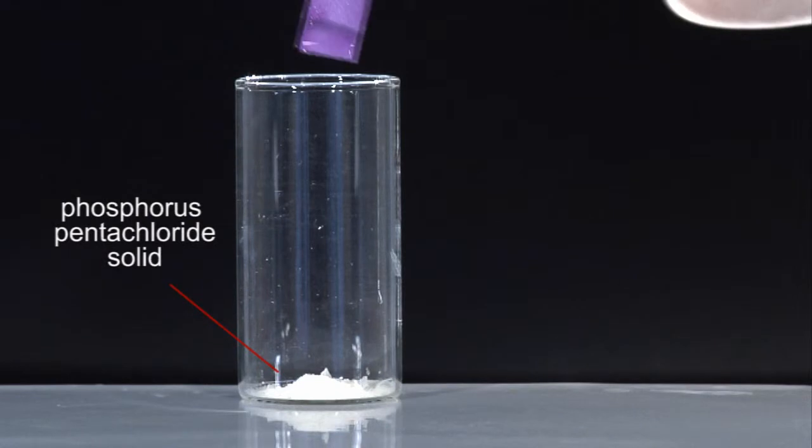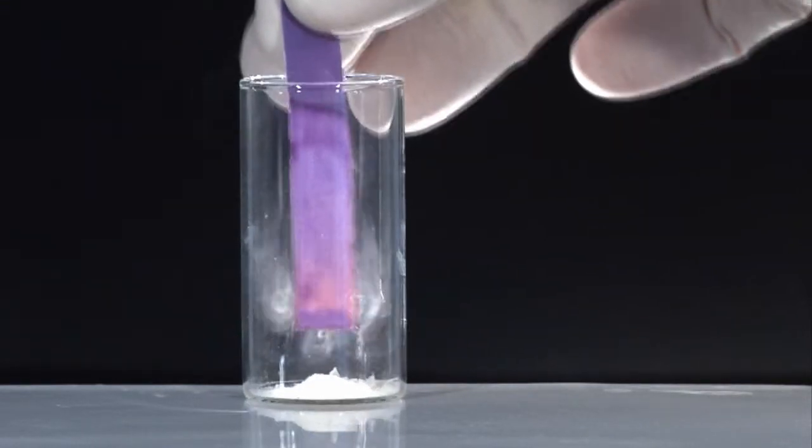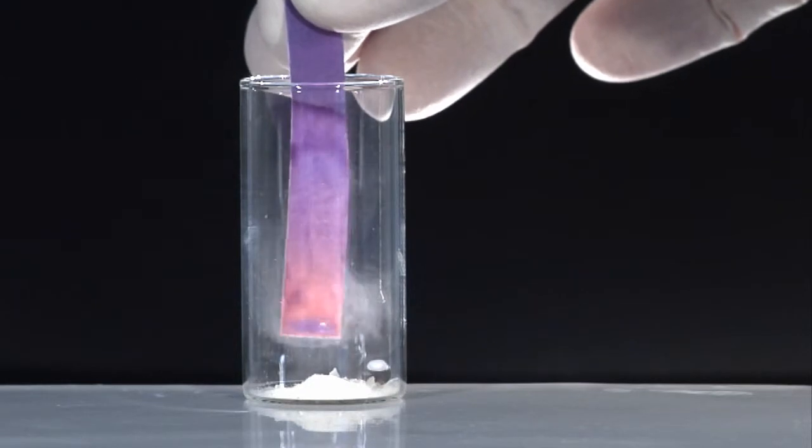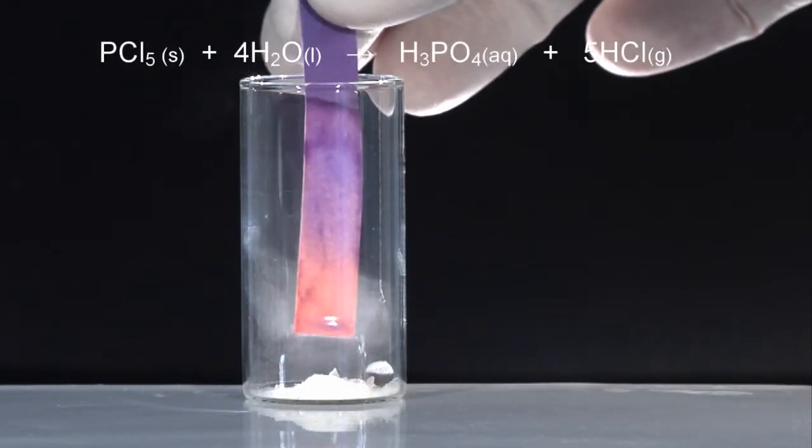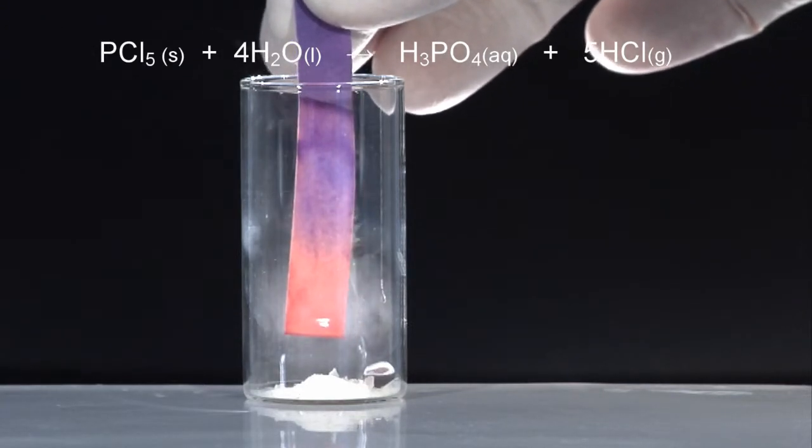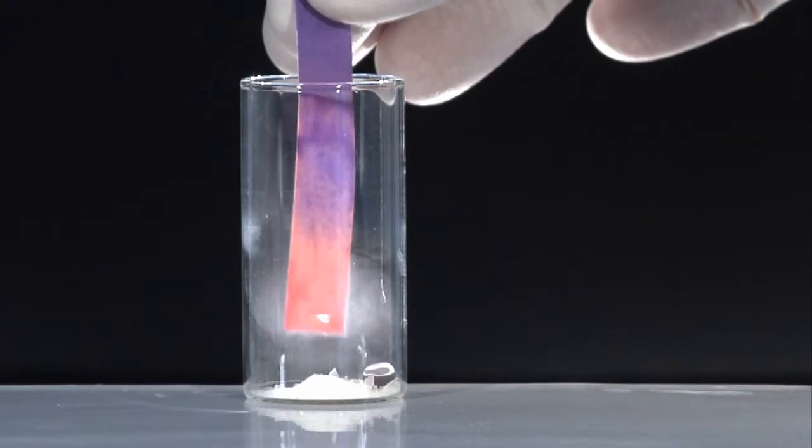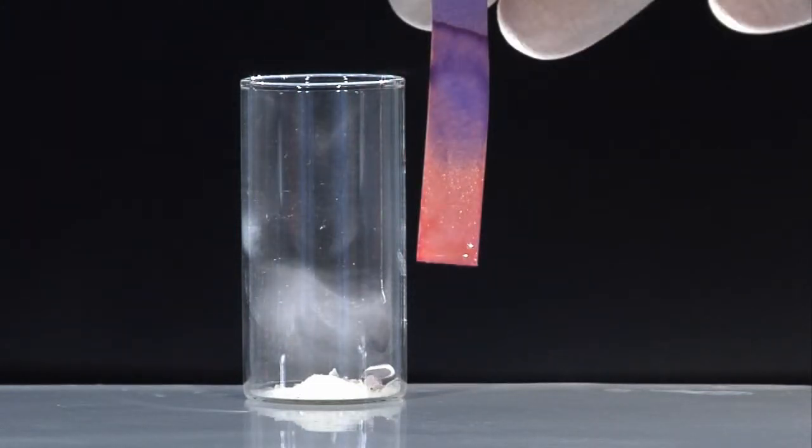When damp blue litmus paper is placed in this sample tube containing some phosphorus pentachloride, it quickly turns red. Solid phosphorus pentachloride reacts with moisture forming phosphoric acid and hydrogen chloride fumes. The hydrogen chloride dissolves in the water on the litmus paper forming hydrochloric acid.